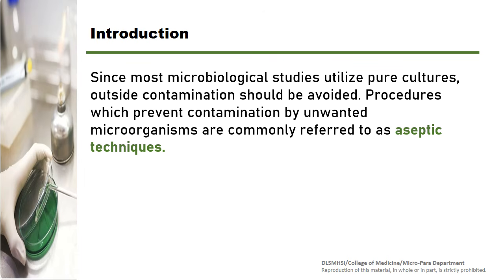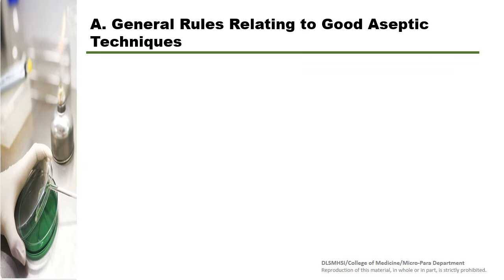Since most microbiological studies utilize pure cultures, outside contamination should be avoided. Procedures which prevent contamination by unwanted microorganisms are commonly referred to as aseptic techniques. Let us discuss some of the general rules relating to good aseptic techniques.